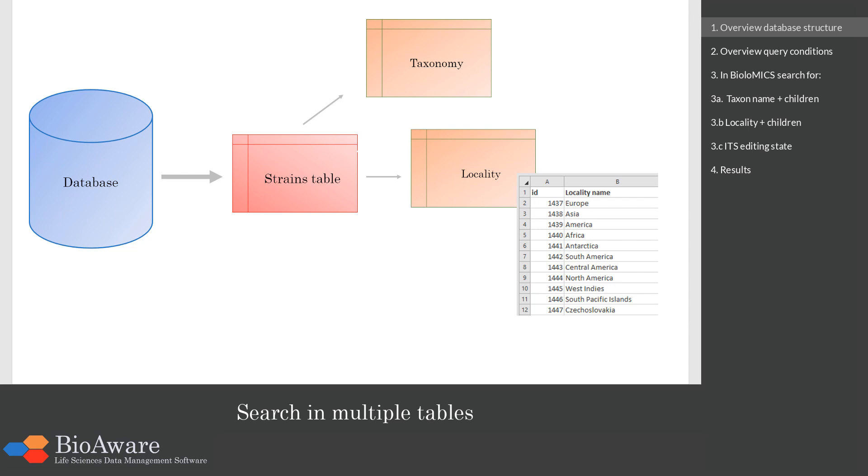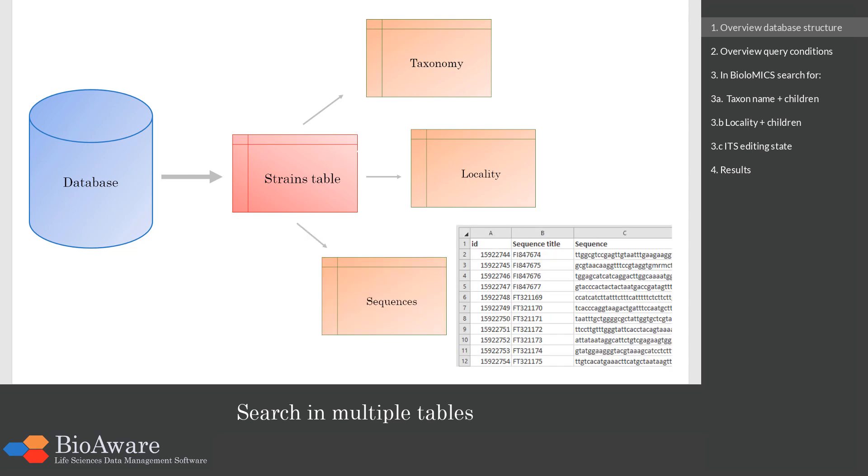The last example used is a link to the sequences table, so we have one record for each sequence.